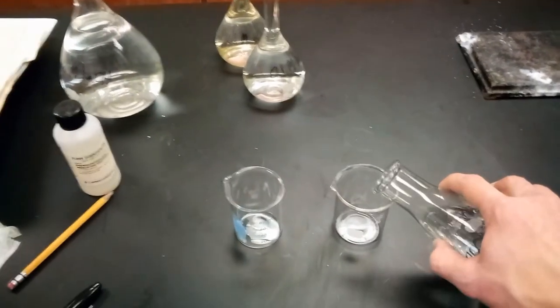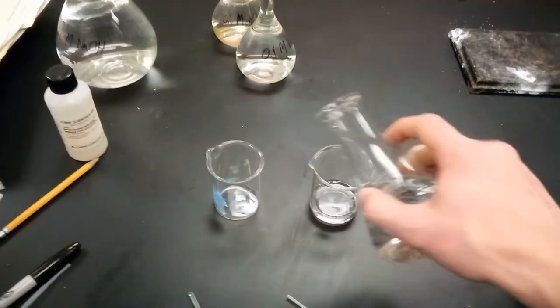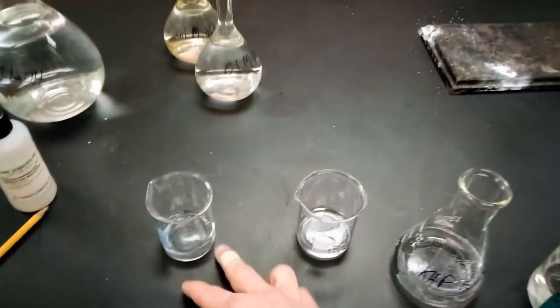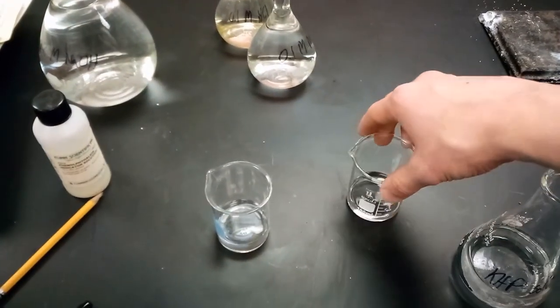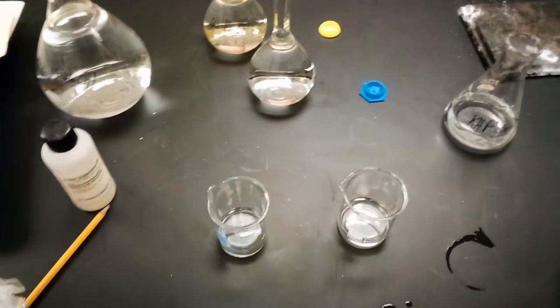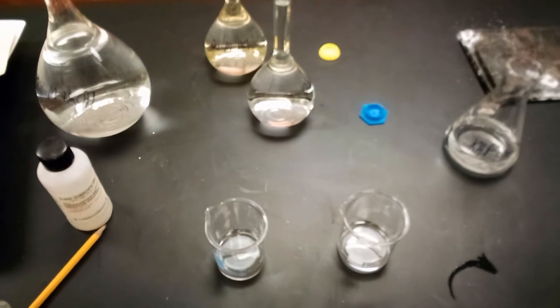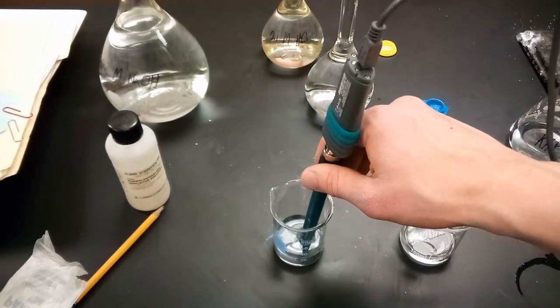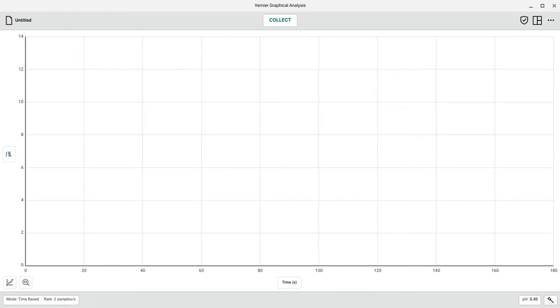Just like that, we'll be testing different things in each of these beakers. The one on the left we'll be adding some hydrochloric acid, and the one on the right we'll be adding some strong base sodium hydroxide. So the first thing we'll do is we'll take our properly rinsed pH probe and we will put it into the beaker on the left filled with our KHP buffer solution. The pH seen on the bottom right of the screen will be the baseline pH level for the KHP buffer solution.